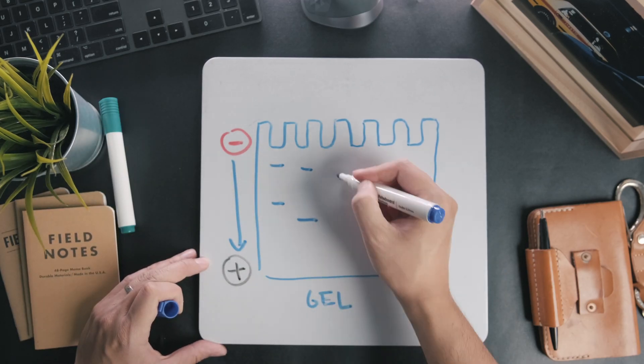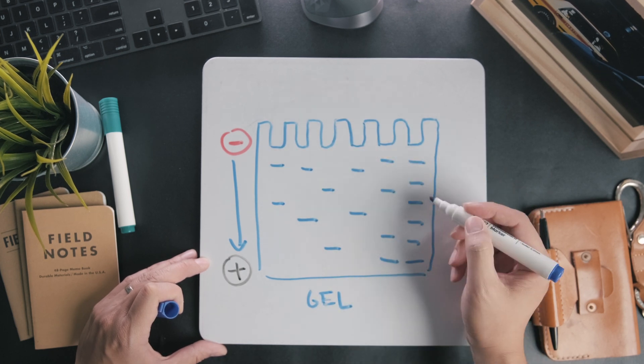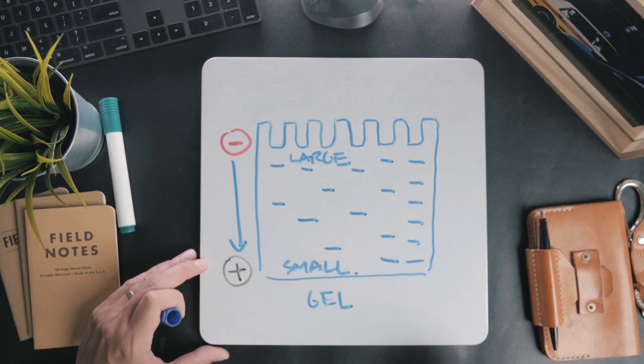As a result, after applying the current for a set period of time, you end up with a gradient of proteins with the larger ones at the top and the smaller ones at the bottom.